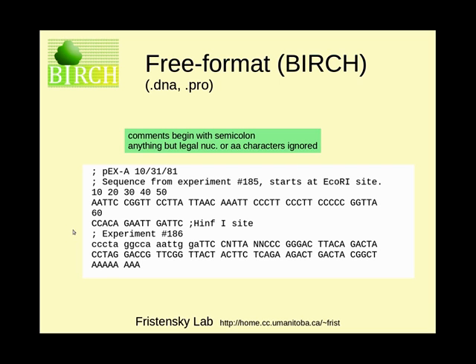So very similar to the raw sequence file format is a format used in the Birch system that we call free format. And by the way, on these title lines, I'm including suggested file extensions. These are just suggestions. There are not always conventions for how you name files, but these are good ones to use.